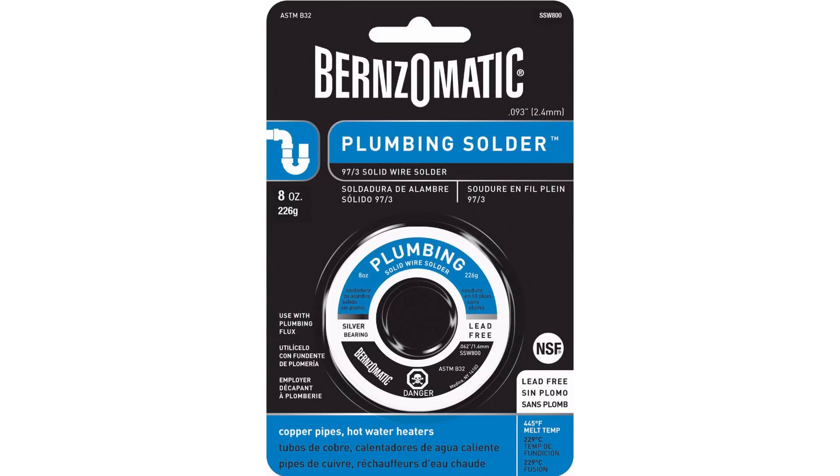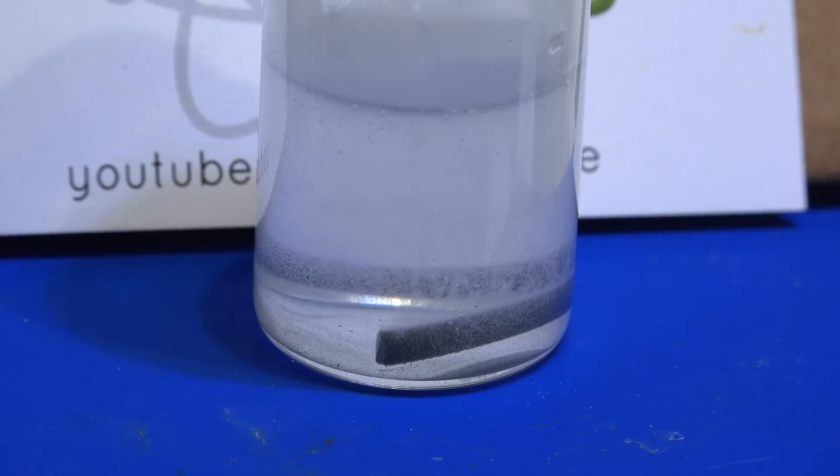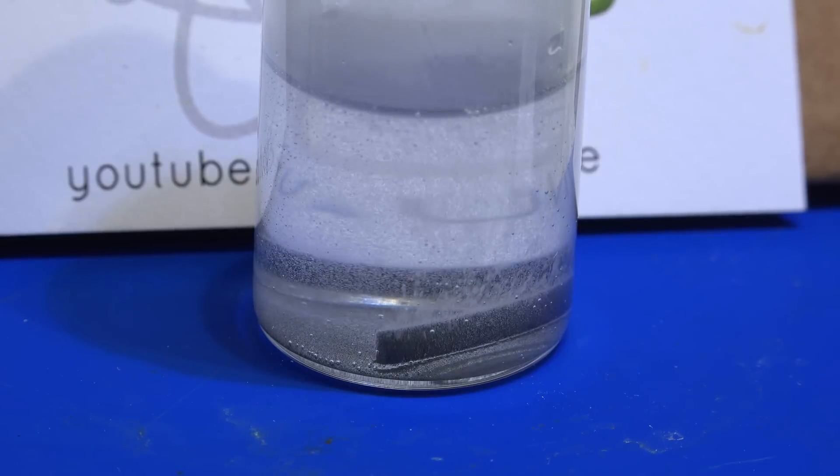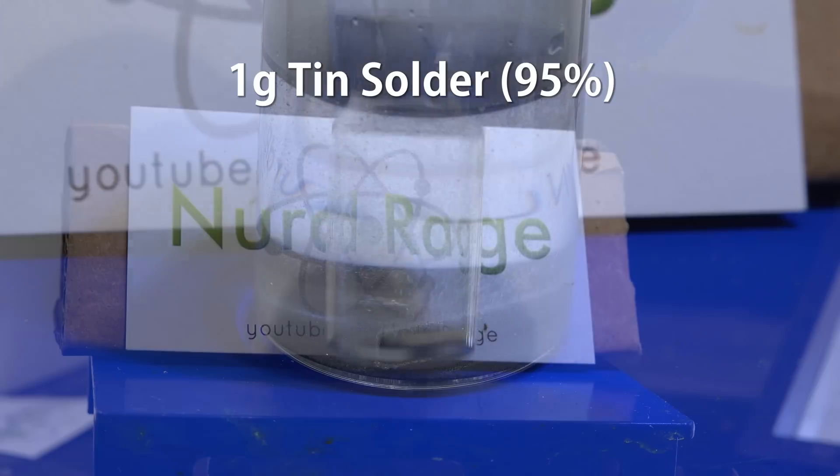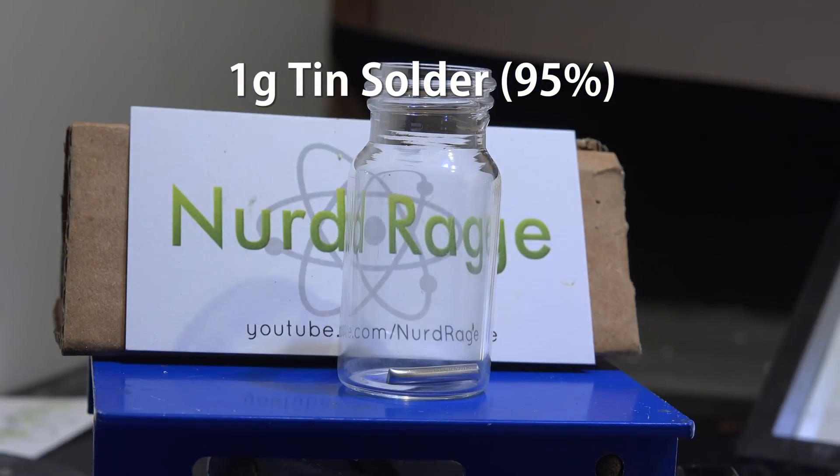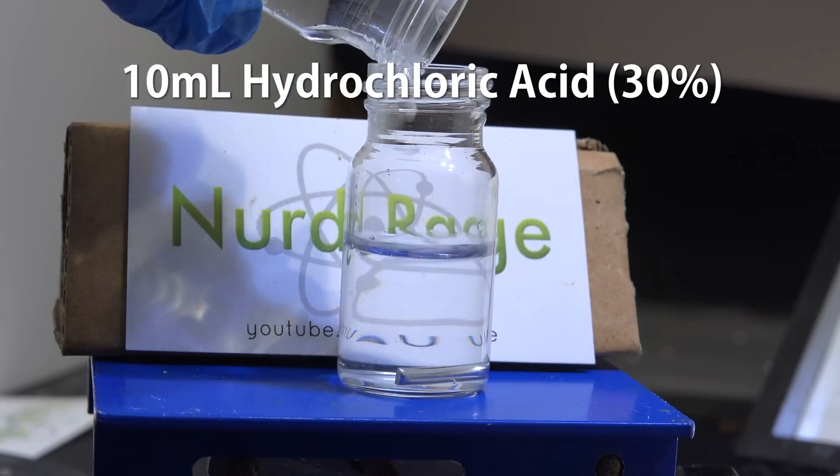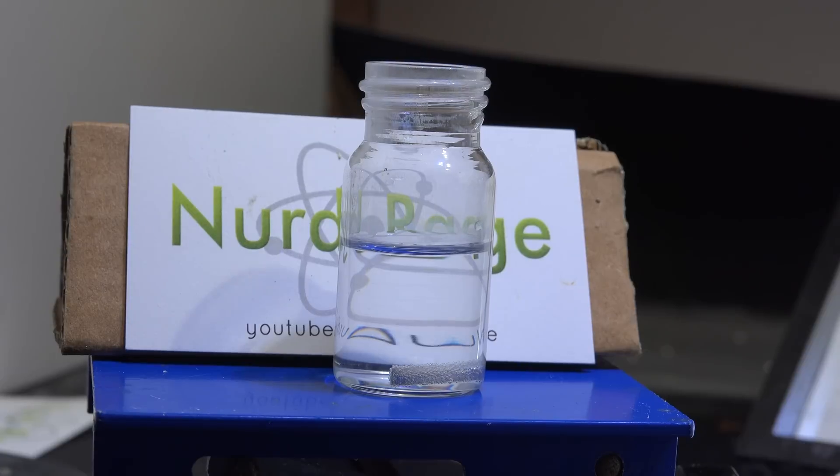We don't want the flux interfering with our work. Now we need to convert it into tin chloride, also known as stannous chloride. We get one gram of tin solder and add to it 10 mL of 30% hydrochloric acid. It should start bubbling.